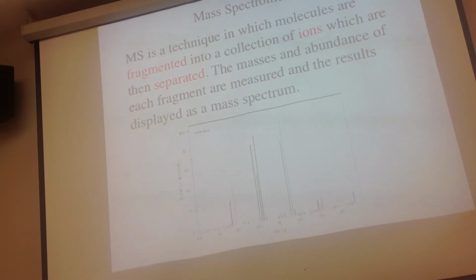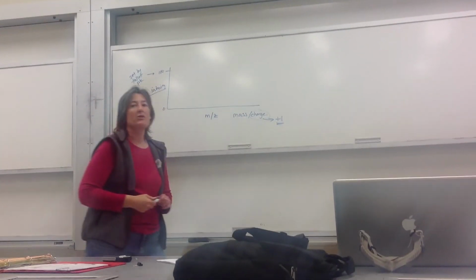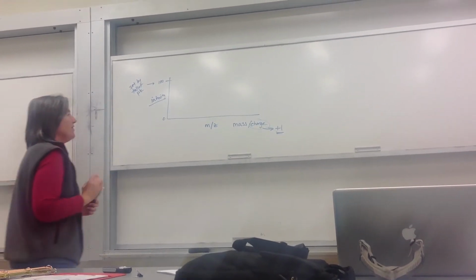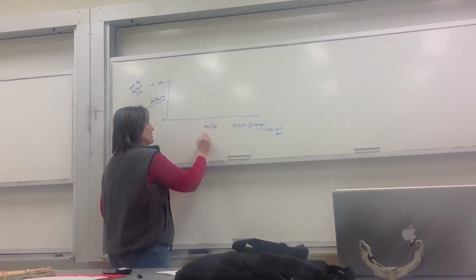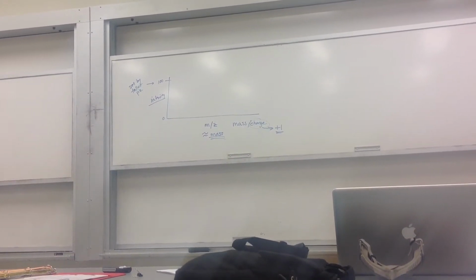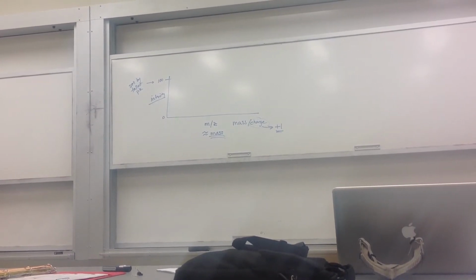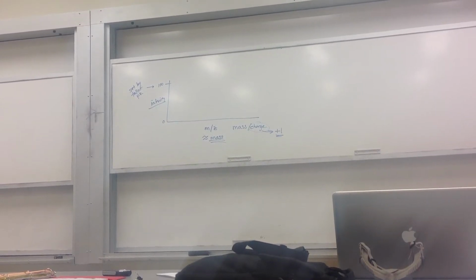Fortunately for us, for everything we're doing, a normal mass spec, it's a plain, boring carbocation, +1. And that's really nice, because what this x-axis really becomes is mass. We're going to ignore the charge part, which is 1, and look at those numbers down there as the numbers that give us the mass of the pieces. That's a simplification that really makes this work well.